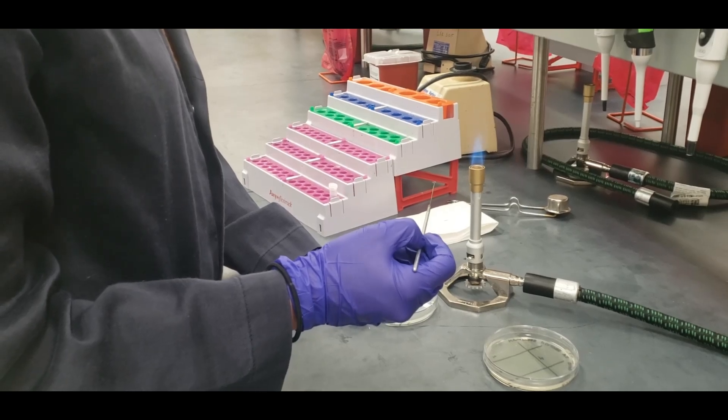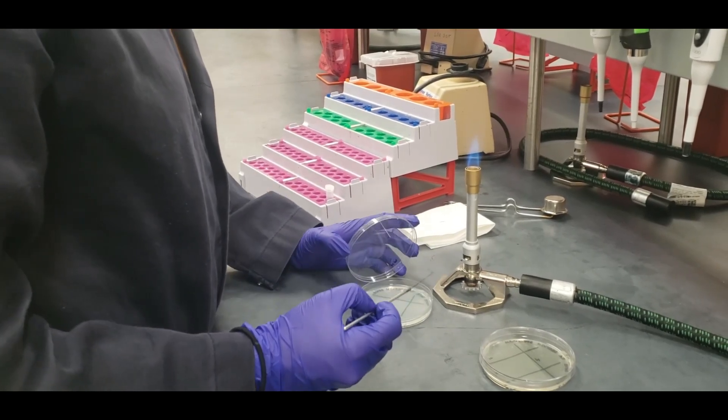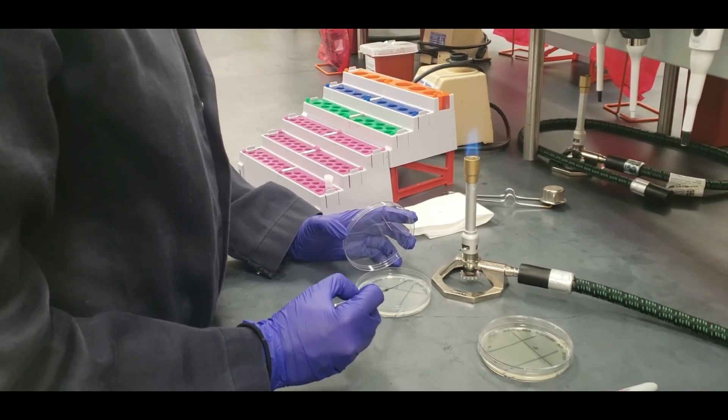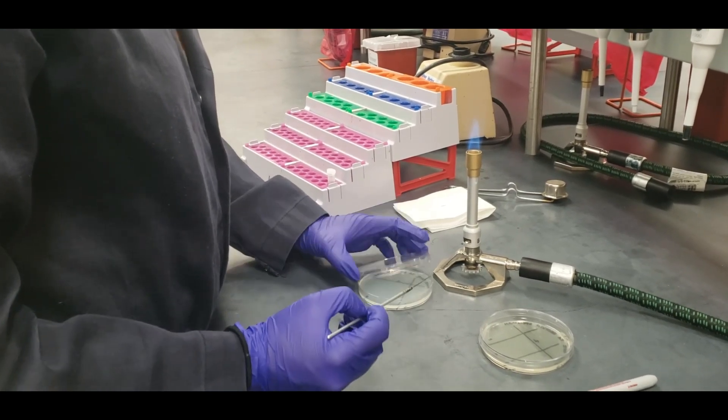Once it's cool, you're going to pull from the first section one time and completely streak the second section without crossing over into the first section.